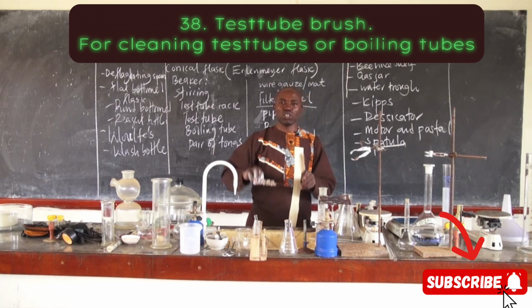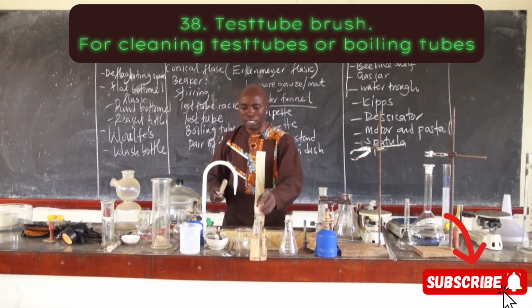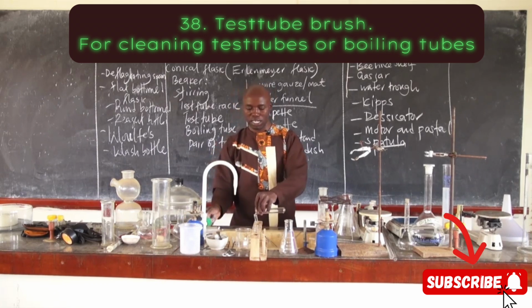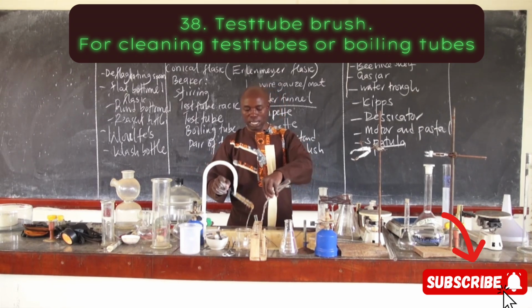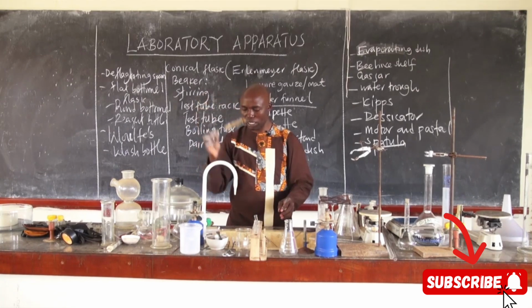Also have what we call test tube brush. They are used for cleaning test tubes and boiling tubes. What we call test tube brush, you can use it for cleaning test tubes or boiling tubes like that. So test tube brush is right here.